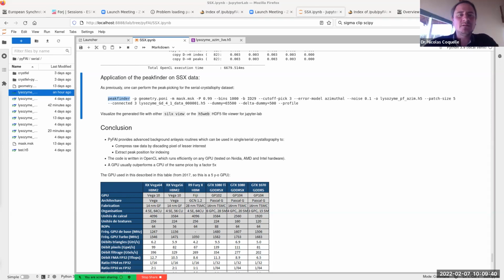But Alexander, that works on indexed patterns, right? Yes, sure. You just feed it the stream file, and then it gives you the output as a log file. Okay. Thanks.